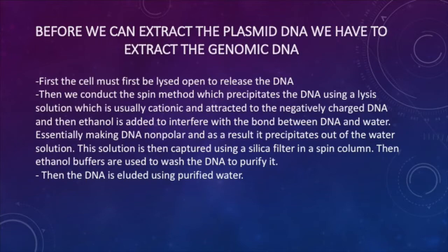This solution is then captured using a silica filter in a spin column. Then ethanol buffers are used to wash the DNA to purify it. Then the DNA is eluted using purified water.